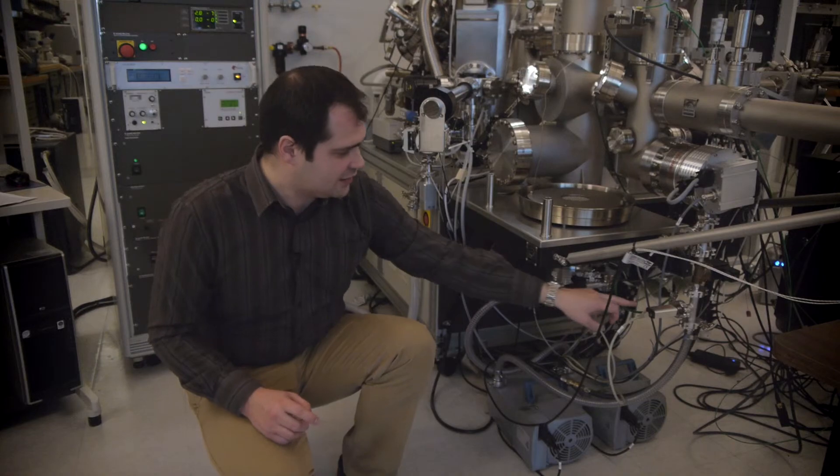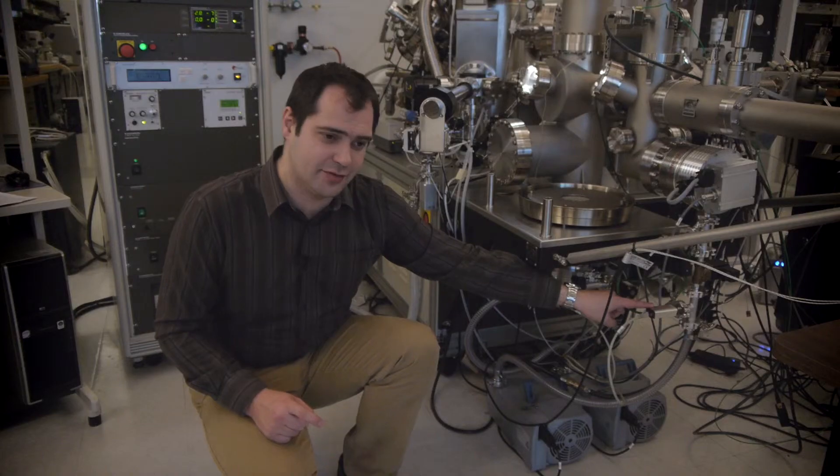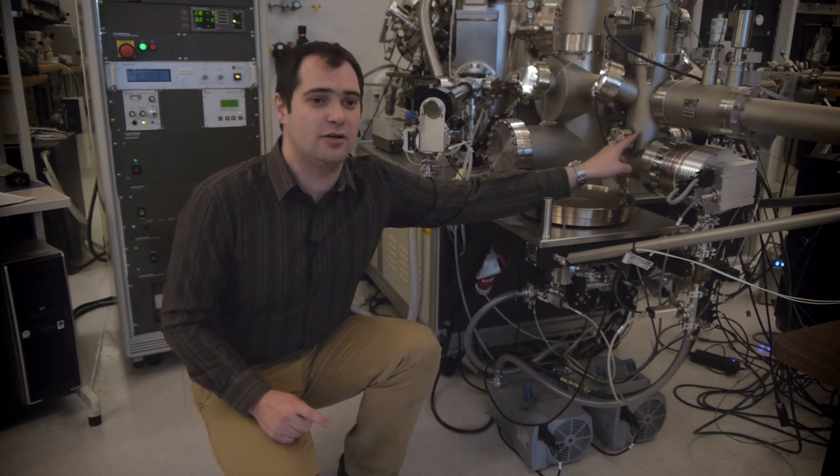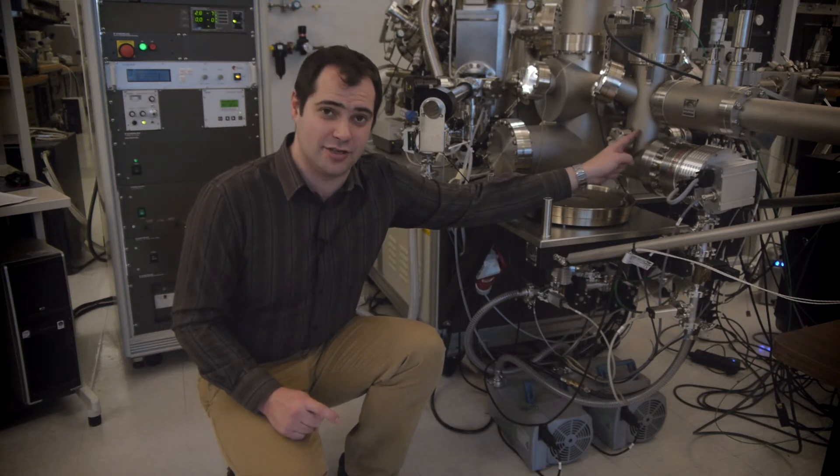We measure at various stages. Here we have a Pirani gauge for measuring our rough pressure. And on the other side of this chamber, we have a cold cathode gauge for measuring our high vacuum pressure or even ultra-high vacuum pressure.